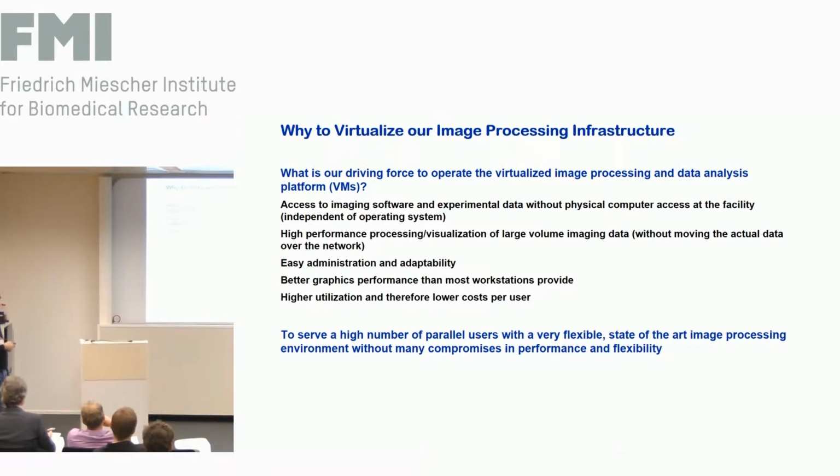Another thing, people will gain access to image processing software as well as their experimental data without the need for physical computer access at the facility. So this is an additional advantage. You don't have these 500 people coming to your facility. You would need a large room. We don't have a room anymore. No one needs to come. It's all virtualized. They can use their laptops, their office computers, and can access high-performance image processing tools.